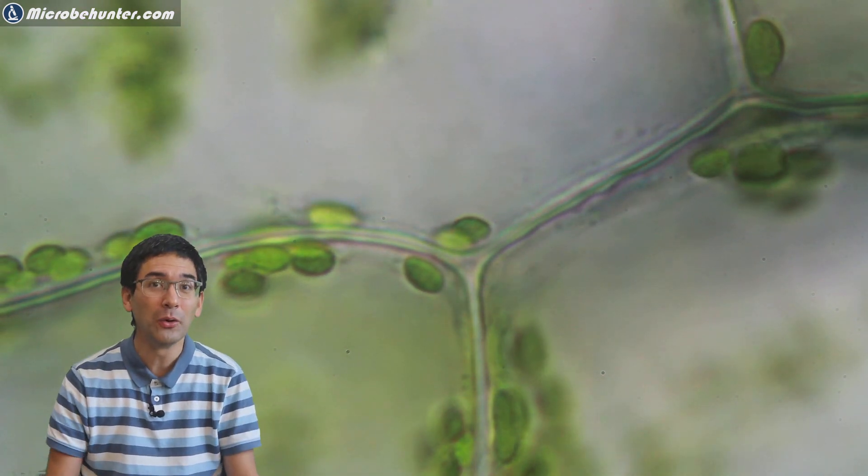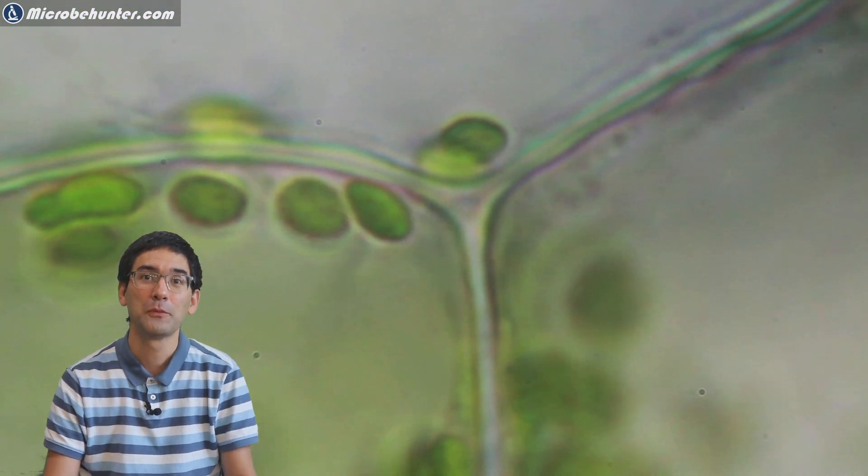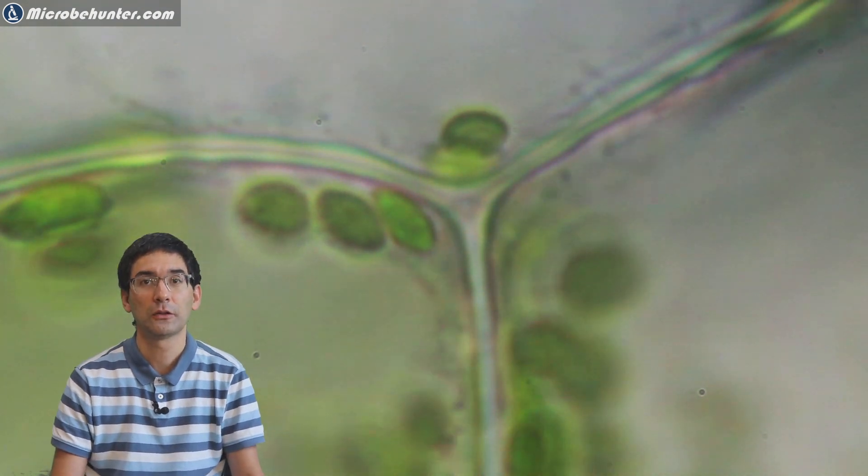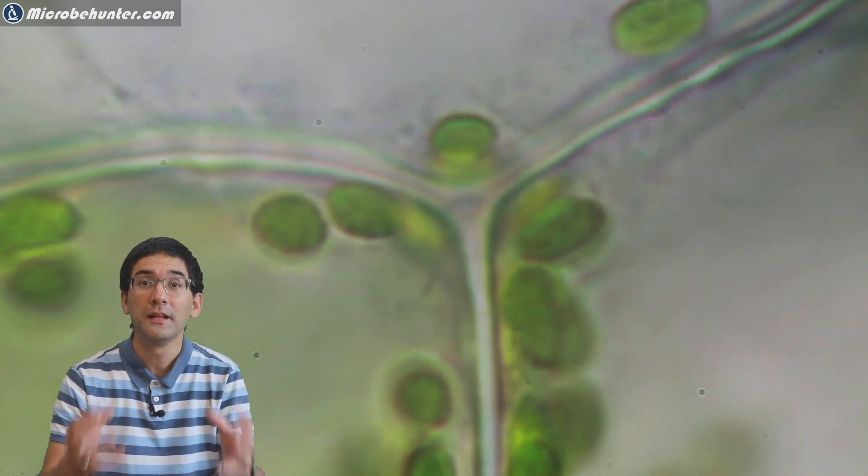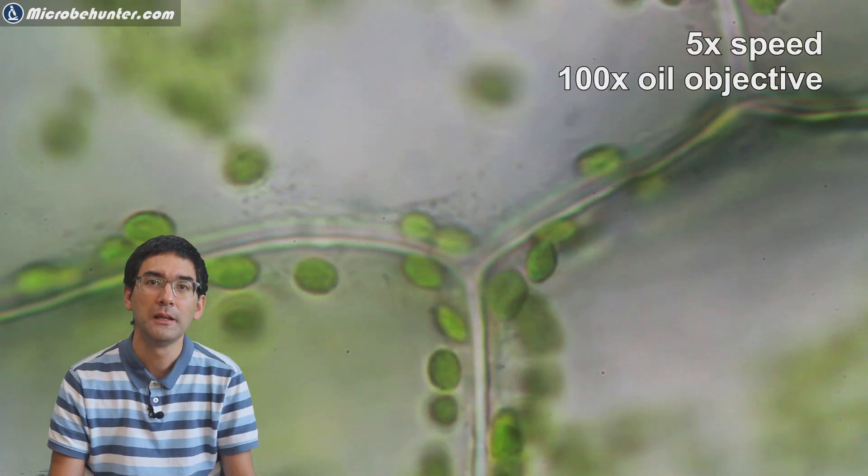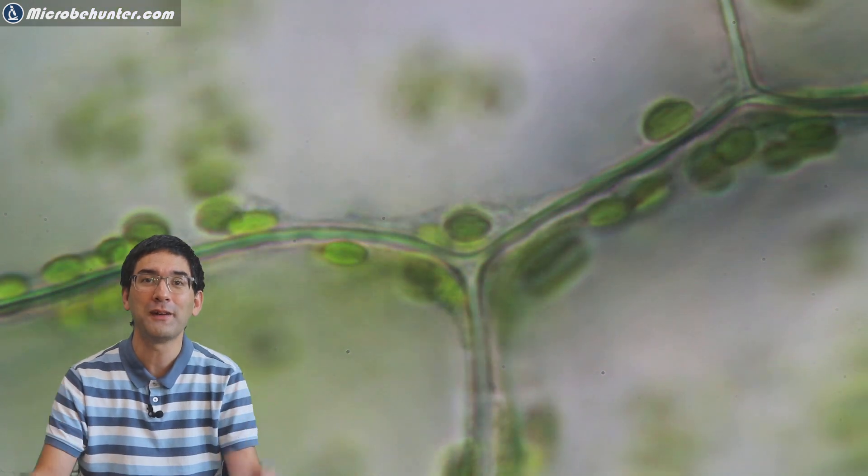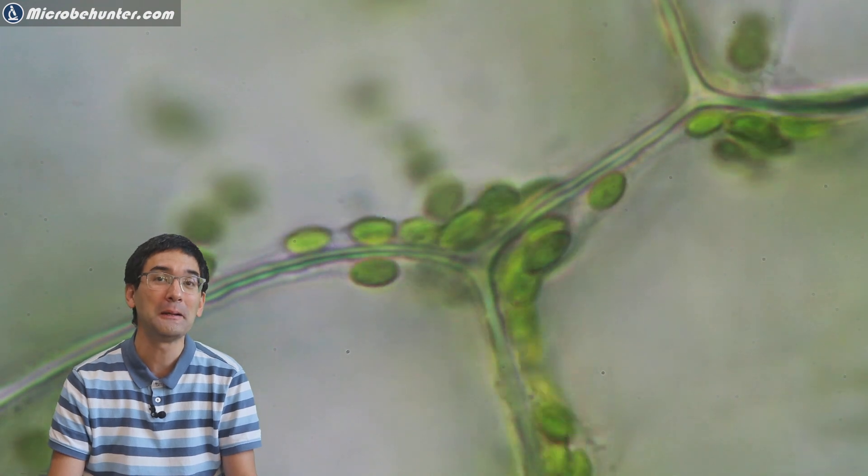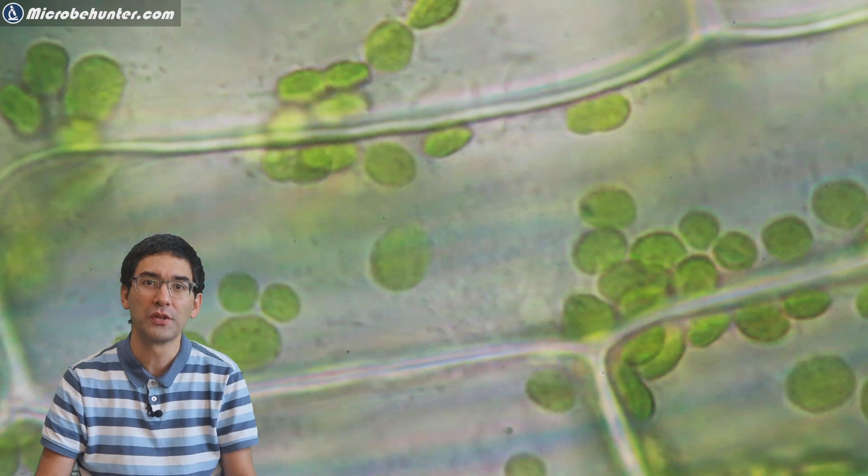Right now, I'm really going at high magnification. That's one thousandth times total magnification. And here, also in real time, we can also see that the chloroplasts now, the movement is much more visible because the more you magnify, then the very small and fine movements of the cell contents can also be observed much better because the microscope also magnifies those movements. The depth of field is already quite low, I have to admit. So sometimes some of the chloroplasts move in and out of focus as well.